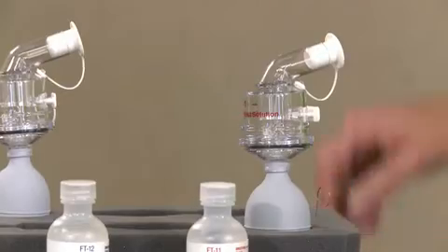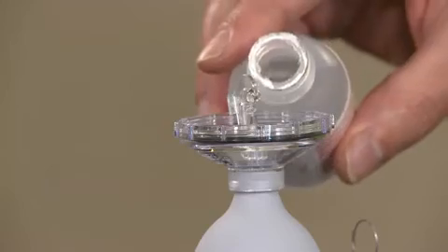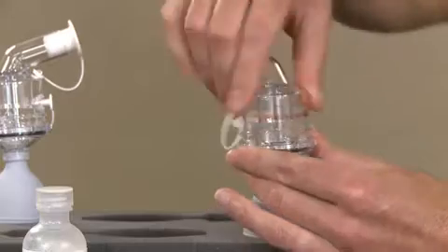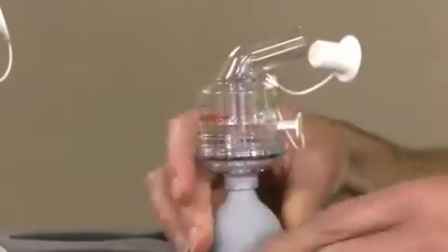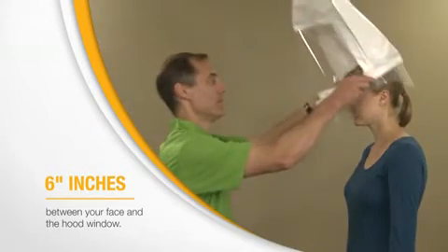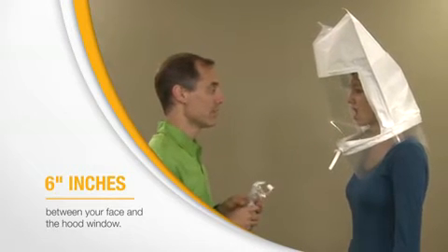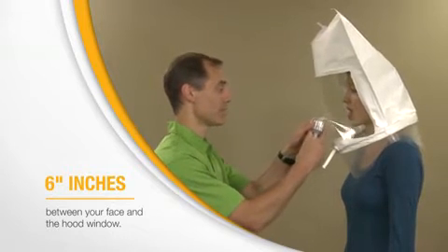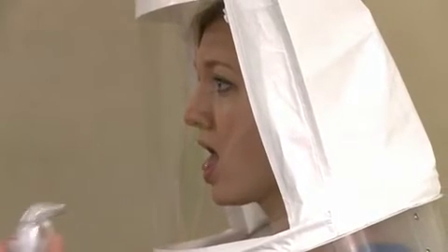The first step is a sensitivity check. It establishes your ability to taste the test agent. You don't wear your respirator for this step. Your instructor will place a hood over your head, positioned so that there is a space of about 6 inches between your face and the hood window, which allows free movement of your head. Using nebulizer number one containing the sensitivity solution, the instructor will initially spray 10 squeezes into the hood through the hole in the window.